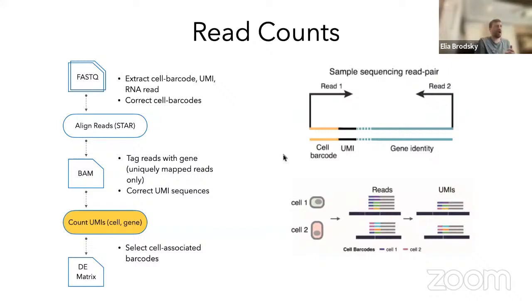Because if I, for example, want to identify a cell type by a marker gene, but that gene doesn't have enough mRNA, it's hard for me to distinguish between low expression and a missing data point, right? That is one of the challenges that we're going to run into at this stage of counting.